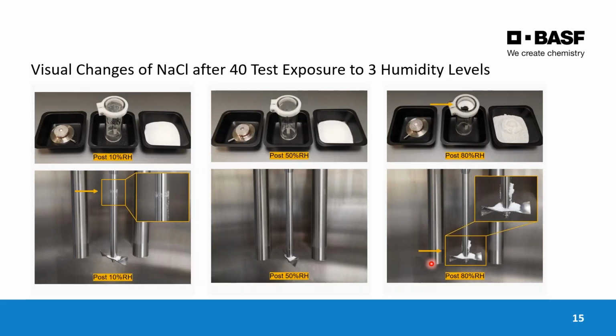Quite credible, I think. If you look at the machine after the experiment, it's sometimes interesting. This is the machine at 10%. And what you can see here is a little bit of powder stuck to the actual impeller. That's probably a bit of electrostatics. At low humidities, things get charged and you see a little bit of electrostatics, even though you don't want to, you do.